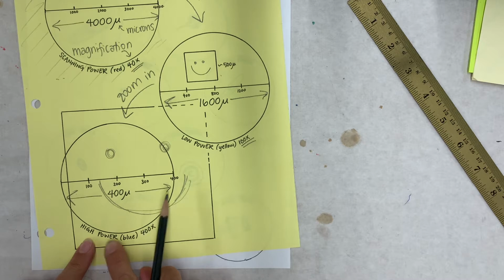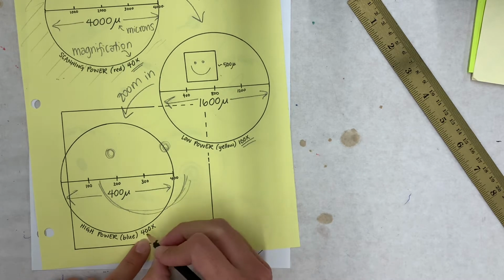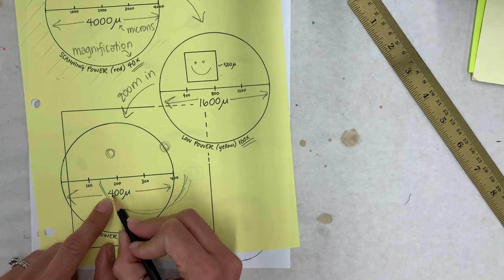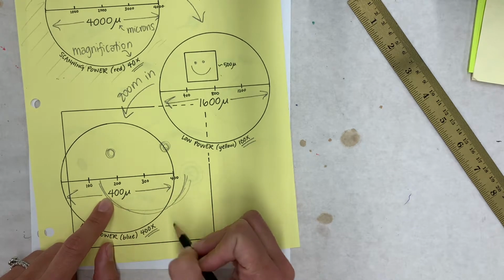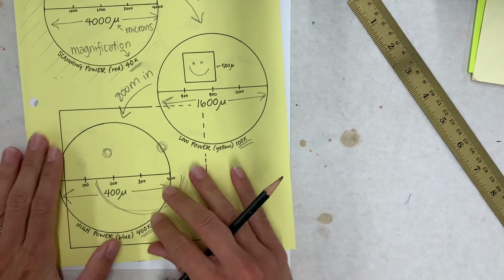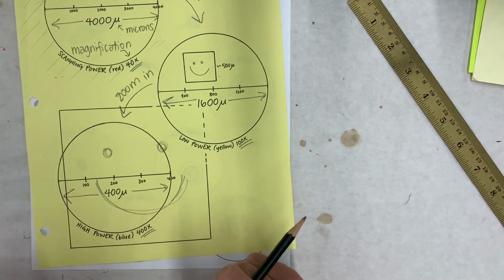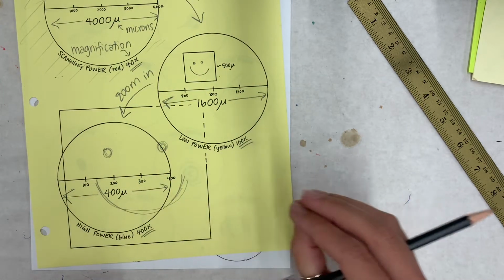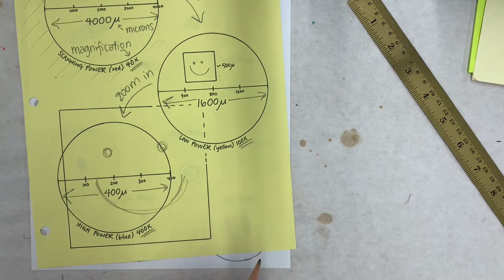So on high power, the blue objective, it is 400 times magnified, and the distance across is known to be 400 microns. Smaller than this distance because we're zoomed in. And this is the most zoomed in we can be under the microscope. So we're going to use this information to estimate the lengths of different specimens.